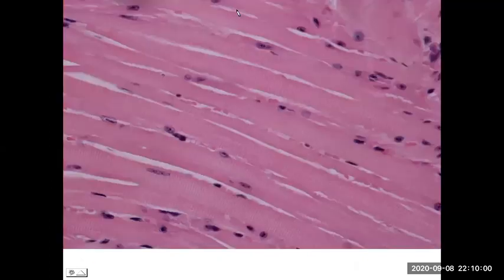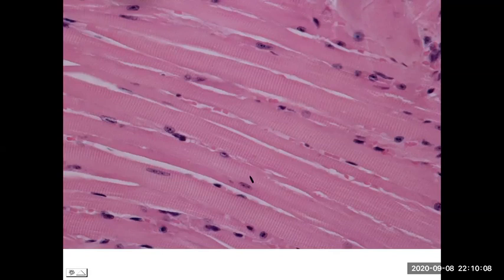And another sample of skeletal muscle is here. So just a different staining treatment, as you notice here. So we're once again looking at skeletal muscle. The striations are really apparent here, the striping. And you can see now this purple stain applied to the nucleus. So just a second sample of skeletal muscle tissue.